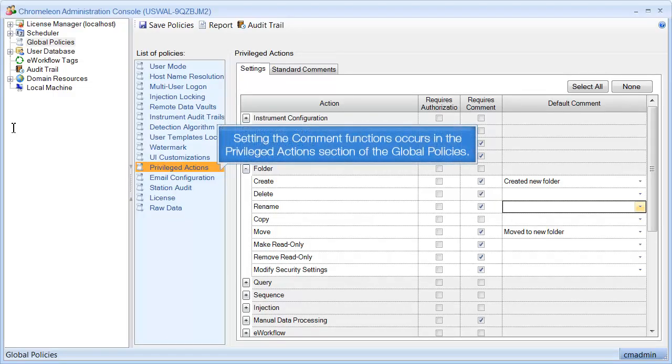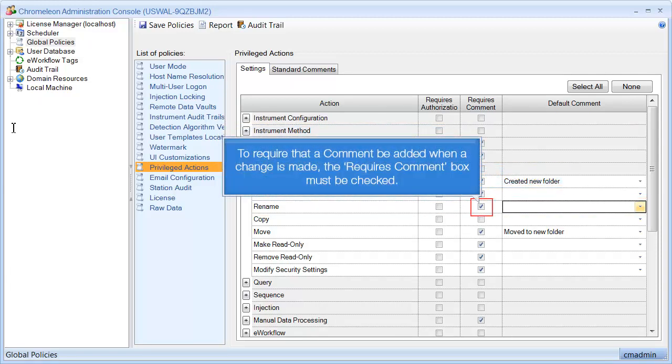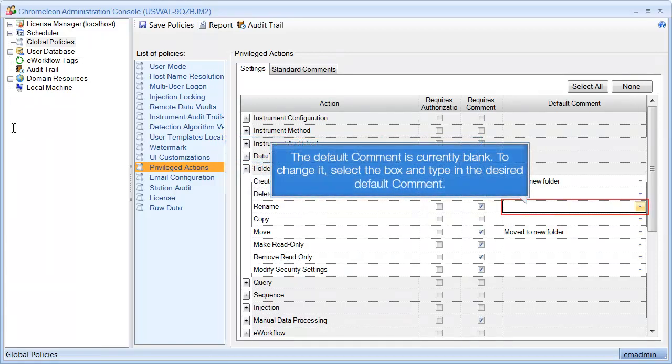Setting the comment functions occurs in the privileged actions section of the global policies. Let's look at the rename folder action. To require that a comment be added when a change is made, the Requires Comment box must be checked. The default comment is currently blank. To change it, select the box and type in the desired default comment.